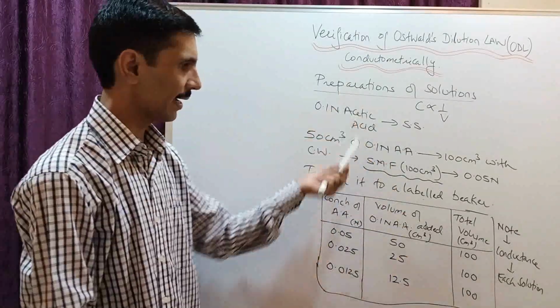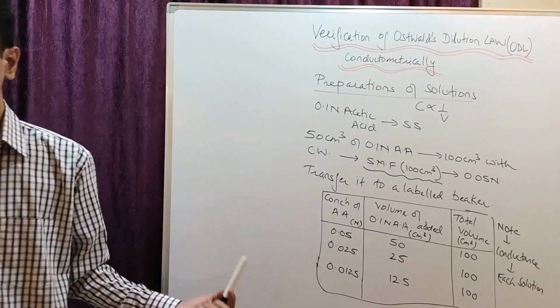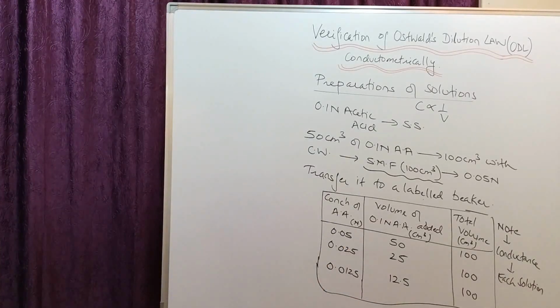तो ये है दोस्तों about the preparation of the solution. So please have a look at it very carefully and try to understand how the solutions are prepared, because if you don't make any mistake in this, the results are always going to be accurate for this particular experiment.